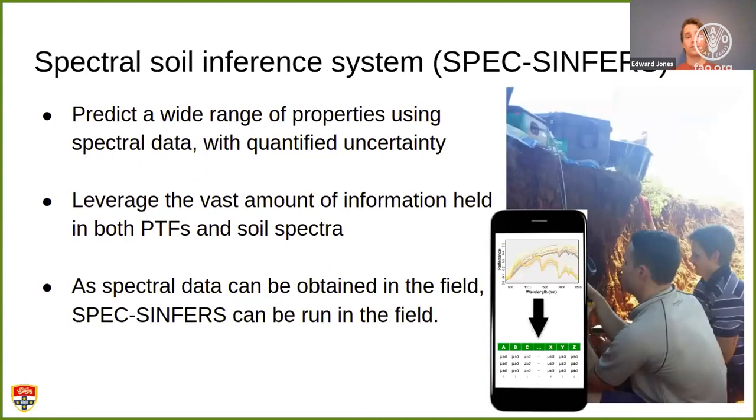So I know this seminar series is all about spectral analysis, and SINFERS is perfectly structured to be combined with spectral soil analysis in the form of a spectral soil inference system, or SPEC-SINFERS. And why is that? As Buddy demonstrated last week, you can predict a wide range of properties using spectral data, which means that you can use this data to initiate SINFERS. This allows you to leverage the vast amount of information stored in both PTFs and soil spectra. Further, more importantly, as Buddy demonstrated last week, spectral data can be obtained in the field, meaning results from SPEC-SINFERS can also be obtained in the field, and you can use these results to make decisions in the field. With a little bit of development, this can occur quickly, cheaply, and efficiently.